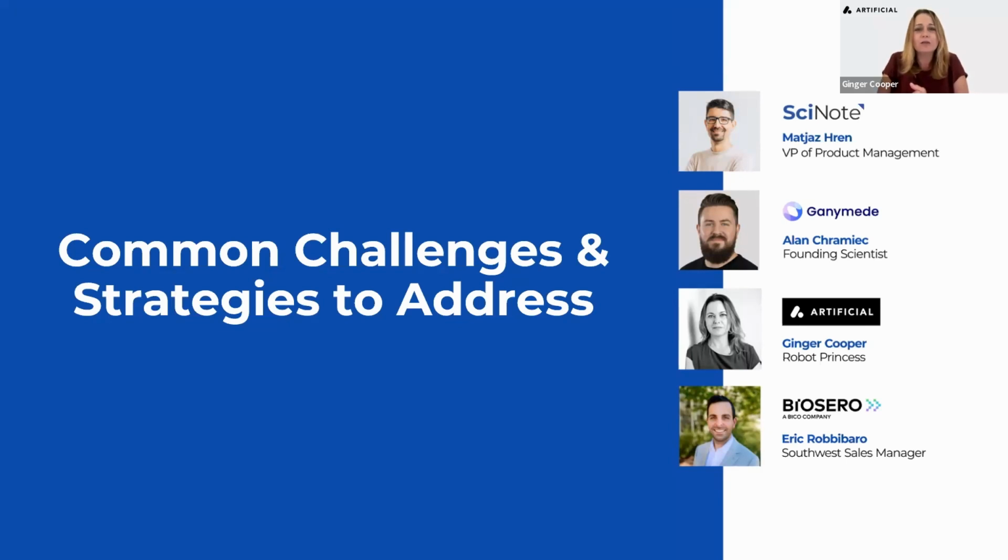And also, a little bit to Alan's point, not everything can be automated, right? Some things are better left as a walk-up liquid handler than fully automating something. Sometimes things are just too complicated to implement full automation. And that's where you can optimize with orchestration, digitization and all of that to gain your efficiencies there. But yeah, plan well for the future, because these things don't die.